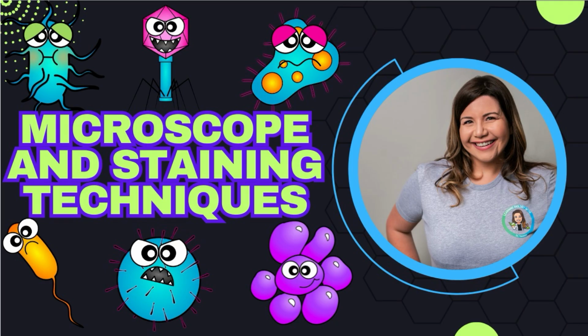Today, we're discussing microbial size, how magnification works, the principles of light microscopy, specimen prep, staining techniques, and how we use all of this to uncover the hidden architecture of life.